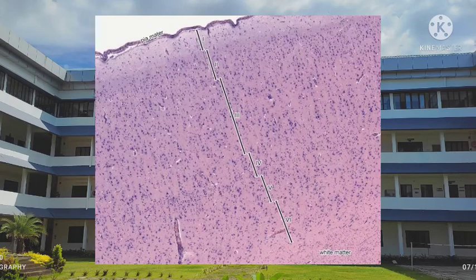The predominant neurons of the pyramidal layer and the ganglionic layer are pyramidal. The largest pyramidal cells, or giant pyramidal cells of Betz, are found in the ganglionic cell layer. The multiform cell layer contains cells of various sizes and shapes.